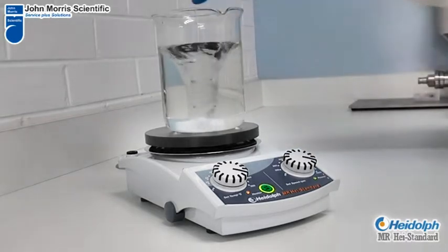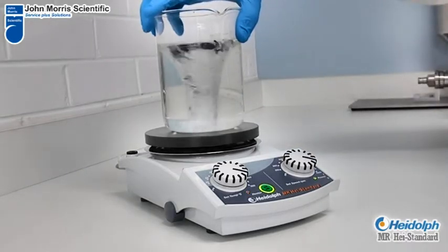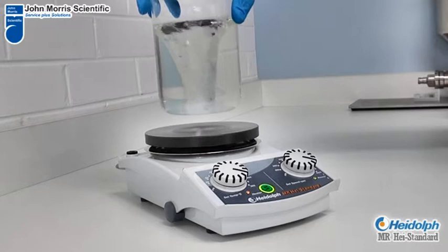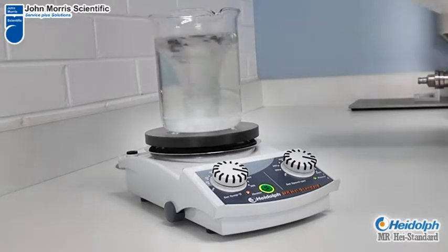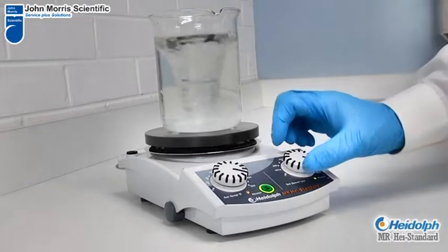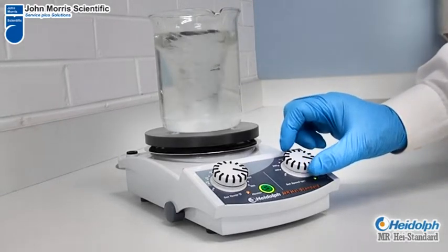A great feature of the unit is the magnetic coupling from the hot plate. It is incredibly strong, allowing excellent stirring power, even allowing for the vessel being suspended above the hot plate for very gentle heating when required.